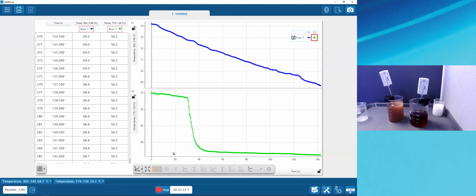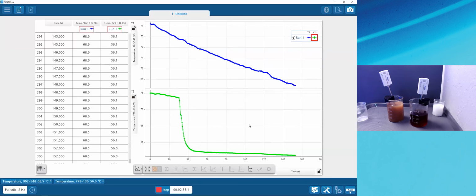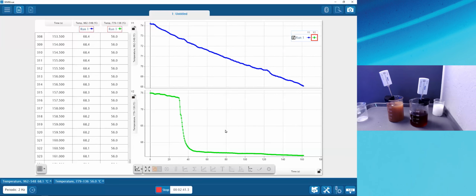One thing that makes it a little difficult in this case is I have two plot areas. Both of them are showing temperature, but they have very different scaling. Wouldn't it be nice if we could kind of combine these two into a single graph? SparkVue chose to just do them separately, which is nice if you have, say, temperature and pH or position and velocity. But when we have two measurements of the same units, I like to kind of put them together on the same plot area. Now, the following is a little bit advanced, but let me just show you it's possible.